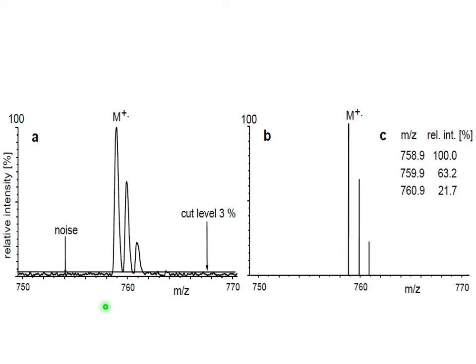To start with, we never measure mass spectra of molecules. What we measure is always ions, negative or positive. And we never measure mass, we always measure M to Z ratio, mass to charge of ion. Charge of ion is always an integer, or whole number. Usually it's +1, sometimes -1, but it can be, of course, any integer number.